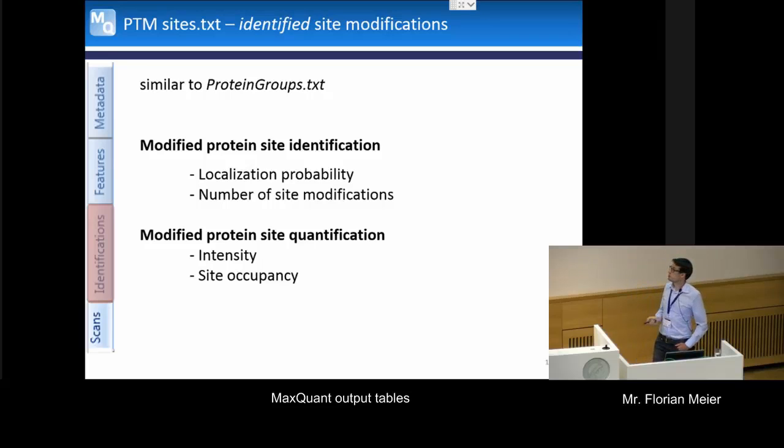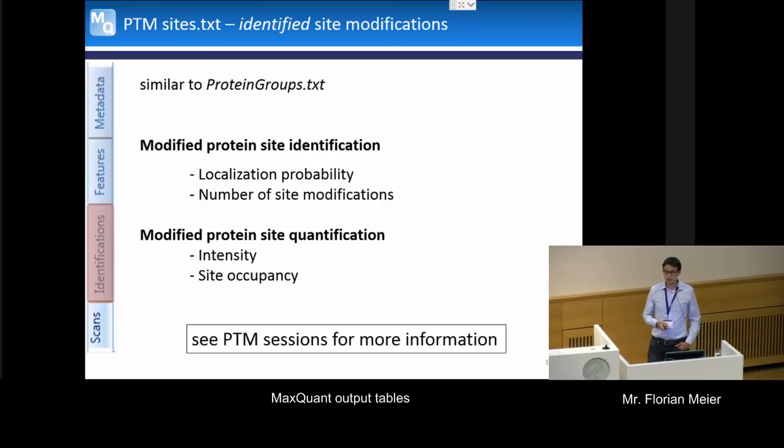And we can also calculate the occupancy of this modification site. So if you're interested in this, I can refer to the talks later from Kirti. She will explain this in much more detail and go through everything that's relevant for PTMs this afternoon.